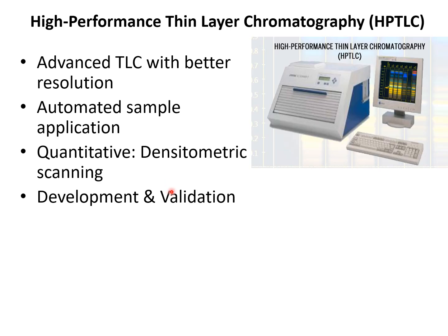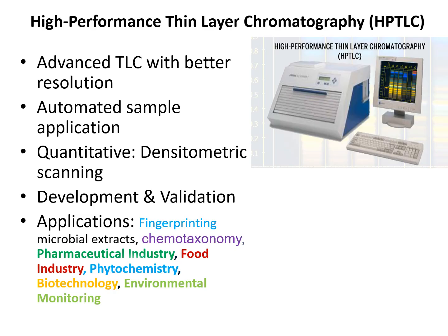So this particular technique has various applications because of its sophisticated features. It is a very useful technique for creating fingerprint of microbial extracts to compare different strains of microorganisms.